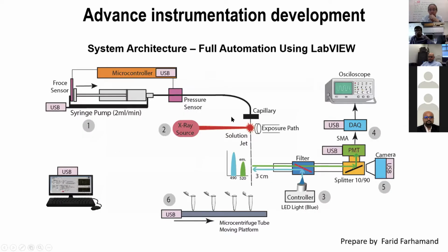With this in mind, this is the schematic. I'll not explain in detail, but you can see we mainly use a light-induced fluorescence configuration of microfluidics. We excite the jet with an excitation wavelength, and we collect the light emitted from the jet to a fluorescence imaging device and use a PMT and fast data collection. This whole thing is controlled by LabVIEW software, and we can get a very fast automated dose response analysis.